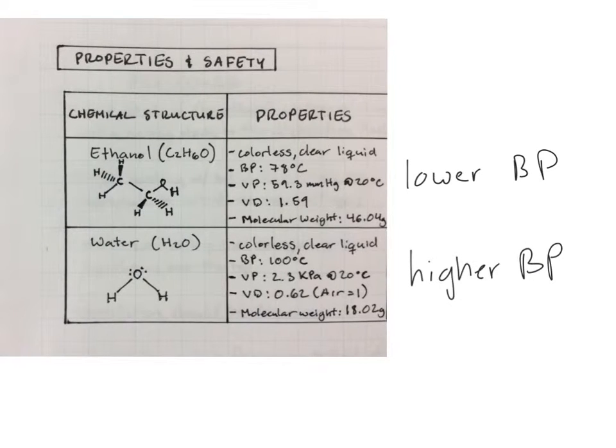So water and alcohol have different boiling points. As you can see, ethanol, the alcohol that we're using, has a boiling point of 78 degrees Celsius, while water has 100 degrees Celsius. In the mixture, we expect the ethanol to lower the boiling temperature of water. So as you start distillation, there will be a mixture in the vapor of ethanol and water. But in fractional distillation, every time it condenses on one of the beads, it'll be a more pure ethanol distillate.